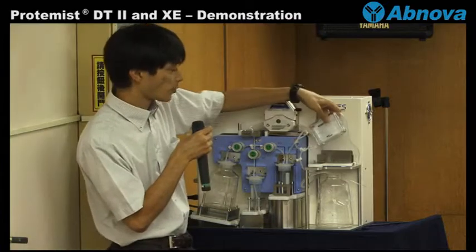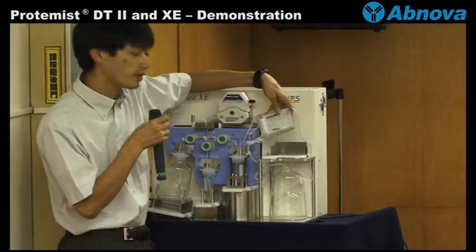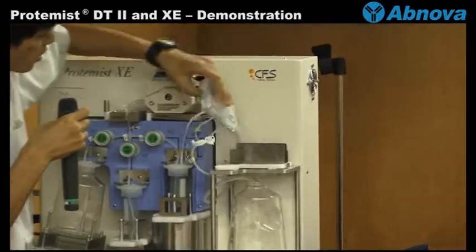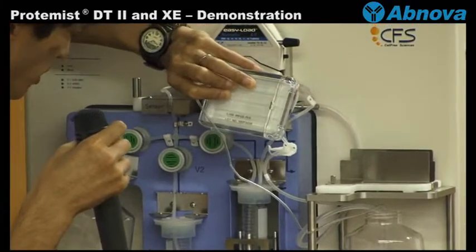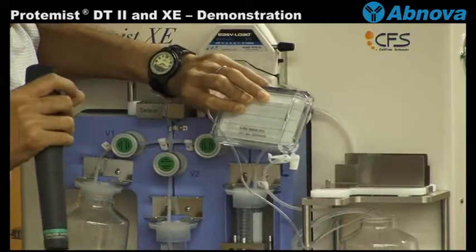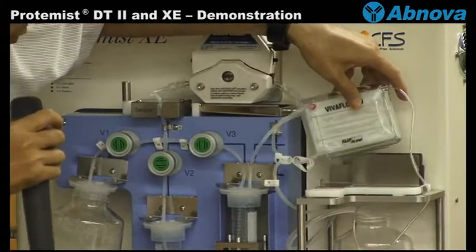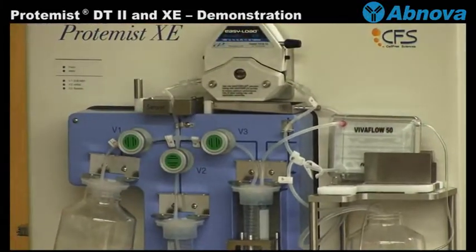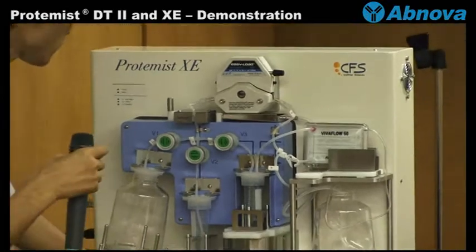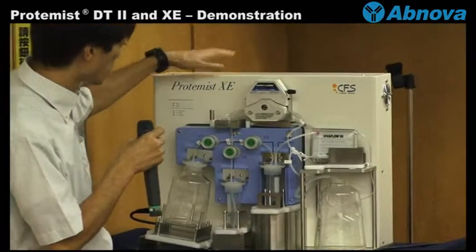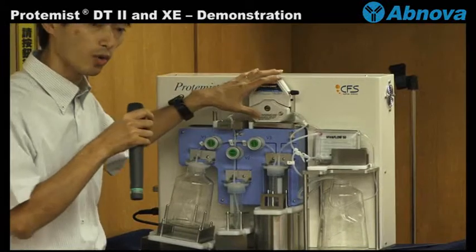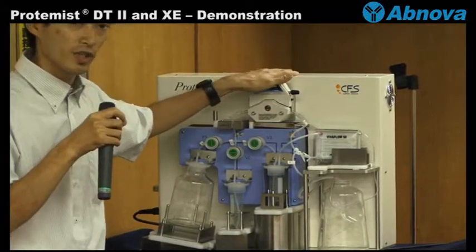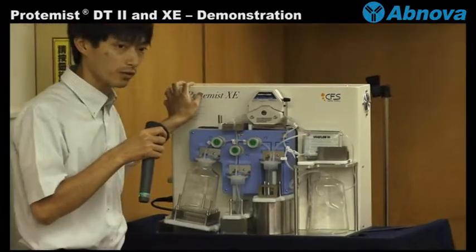This is a filter, the 10,000 dalton molecular weight cutoff filter. So this filter, the translation buffer is exchanged. This has the pump. The moving part is only a pump, so this is almost maintenance-free. Very easy to handle.